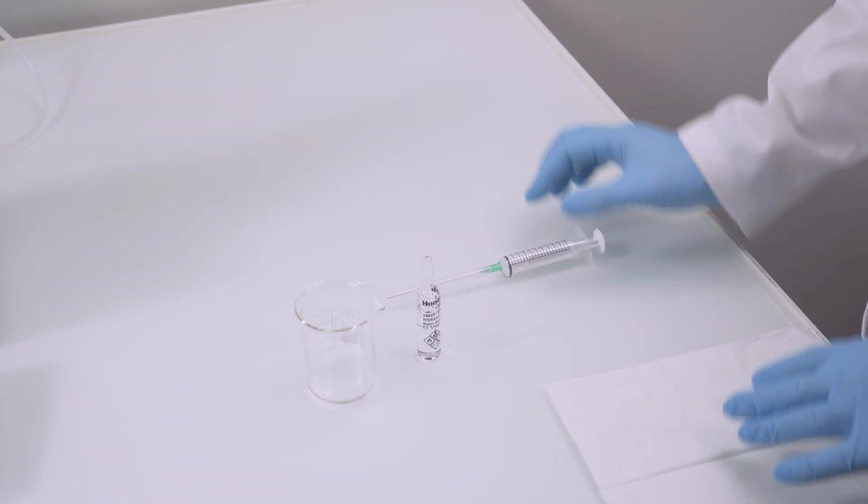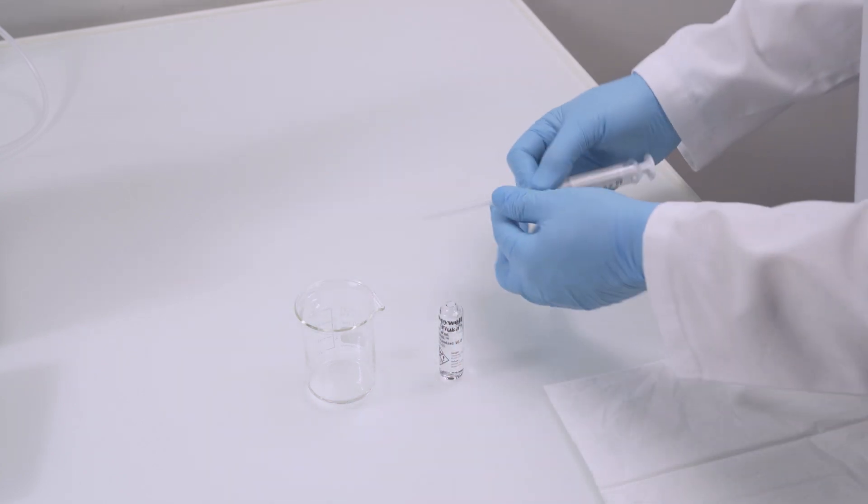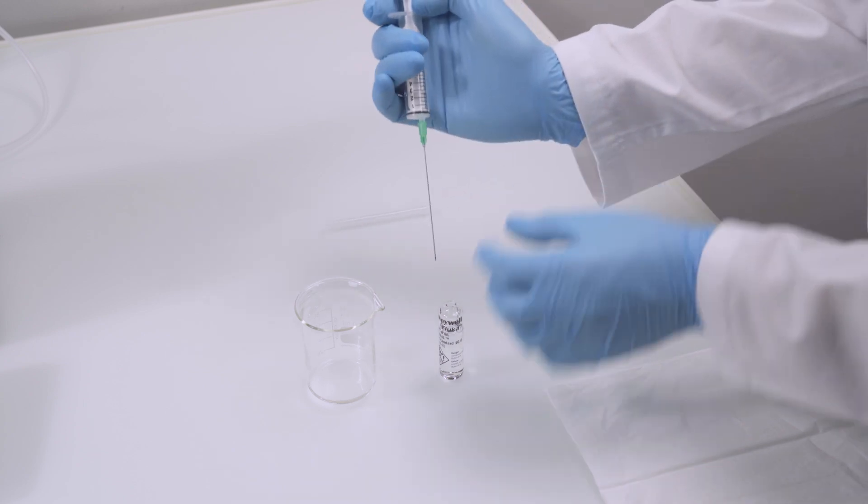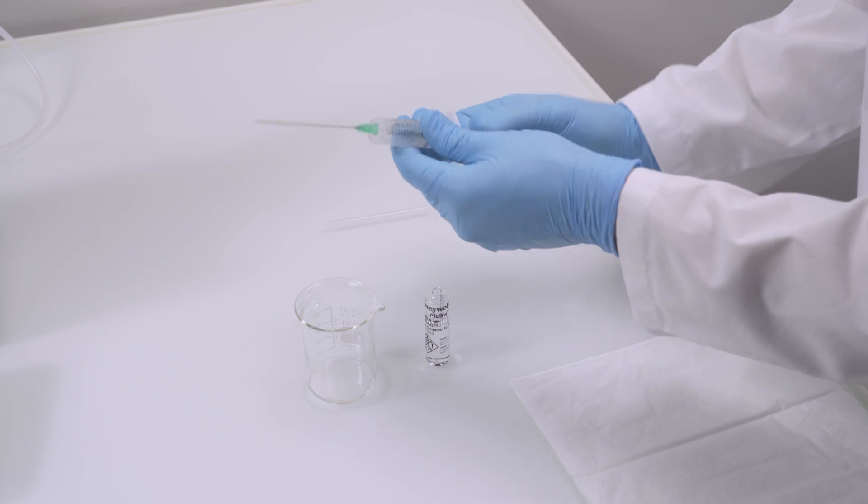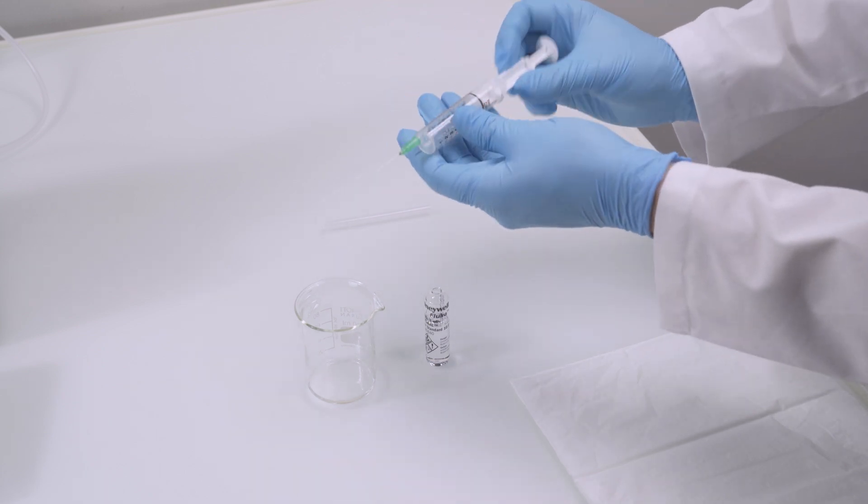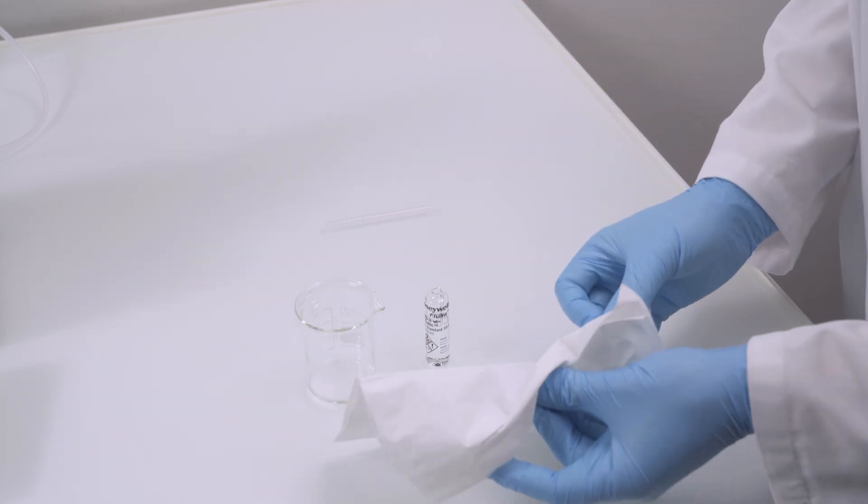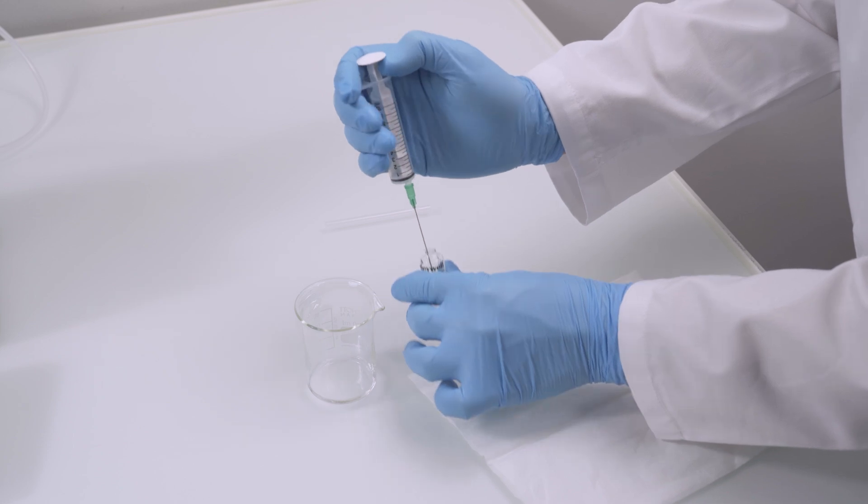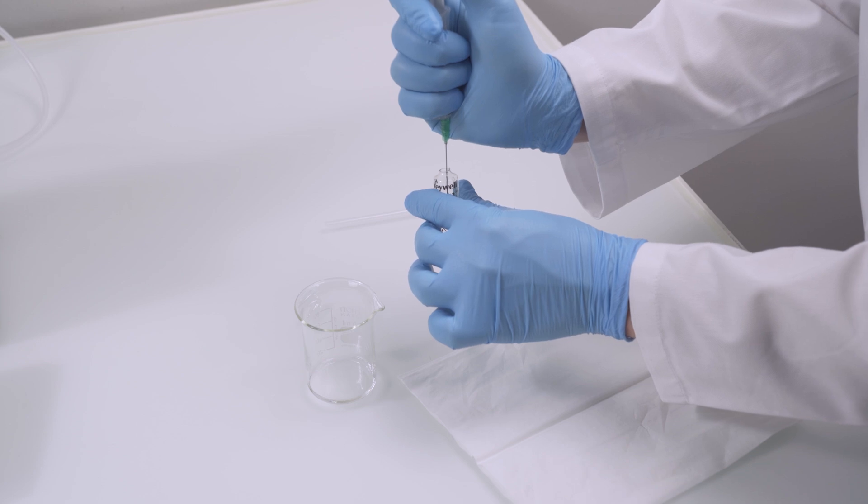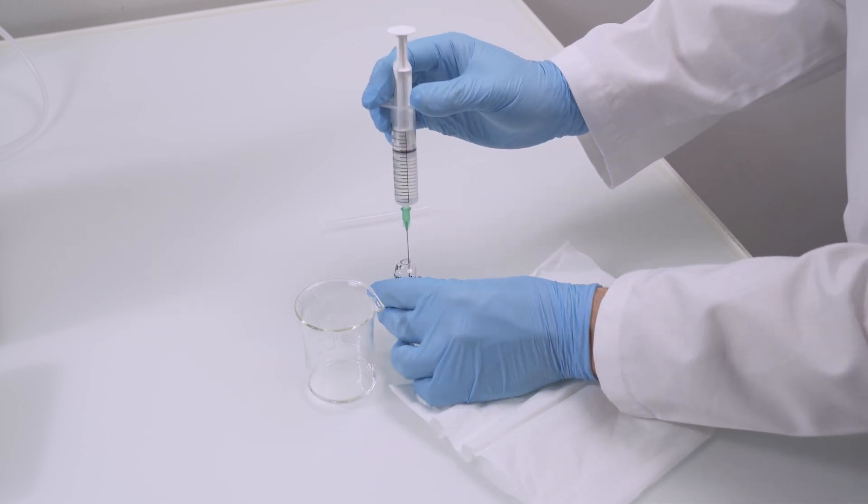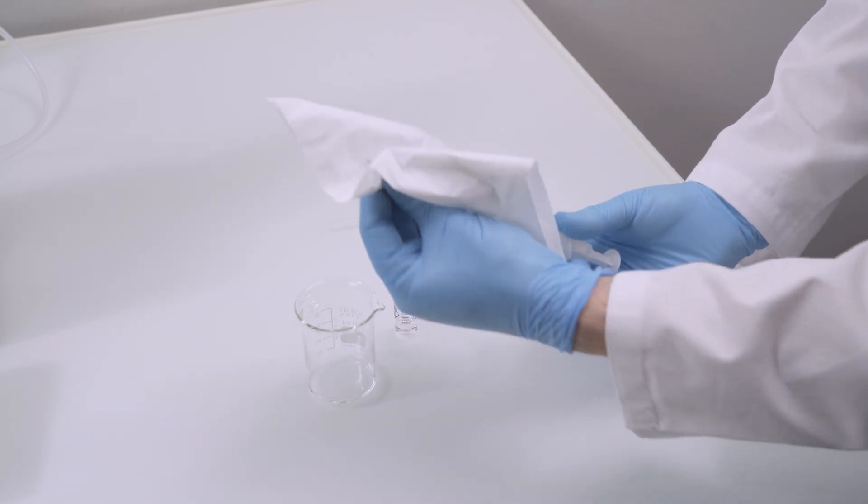To prepare the certified water standard for the concentration determination, open the ampulla and pull approximately 0.5 ml of the standard into the syringe. Wet the inside and rinse it out to remove the residual water. Then fill the whole syringe with the standard. Make sure to remove all the air from the syringe.